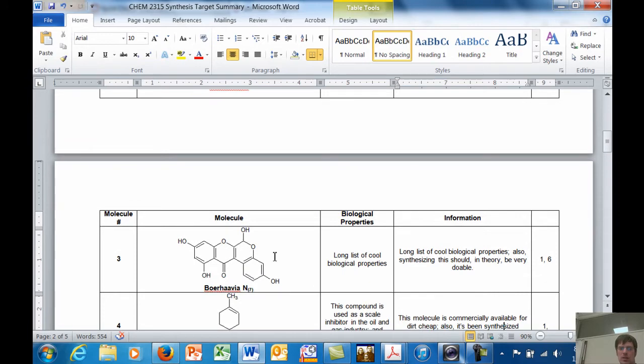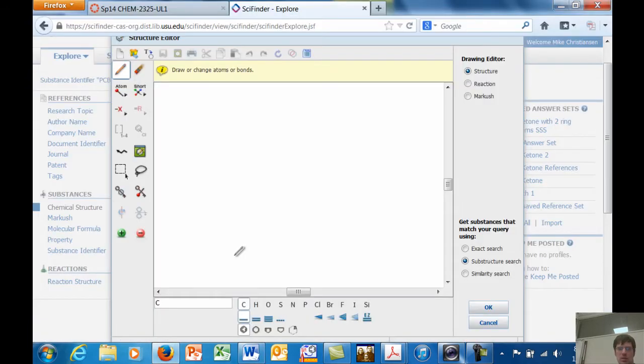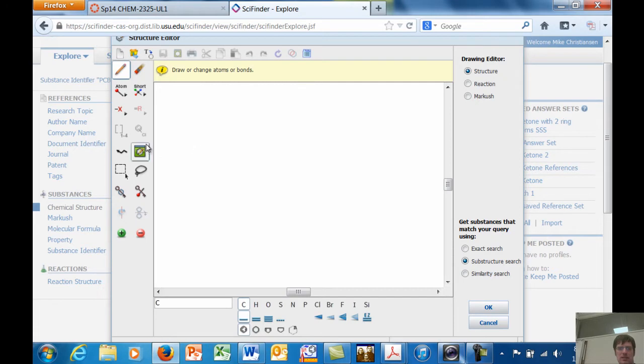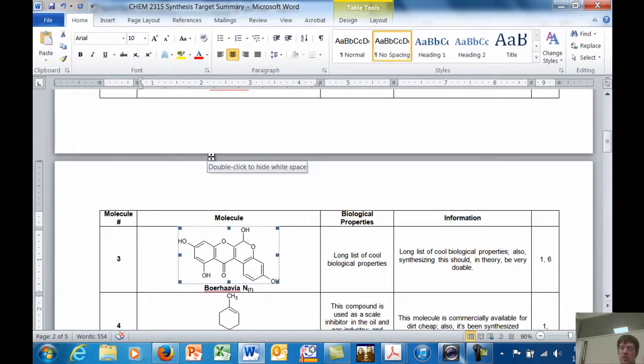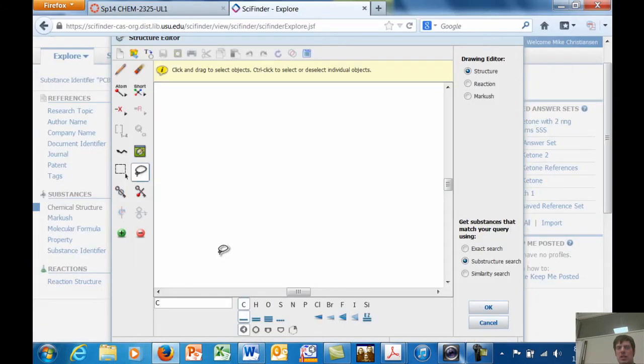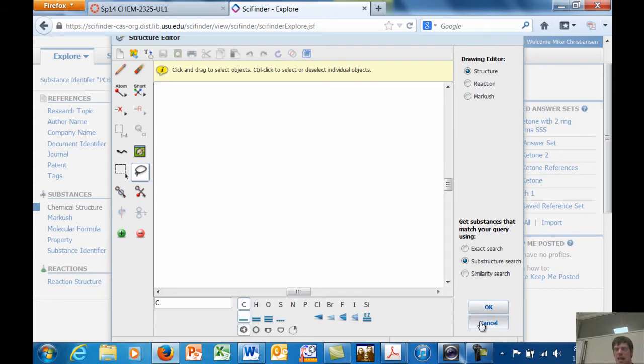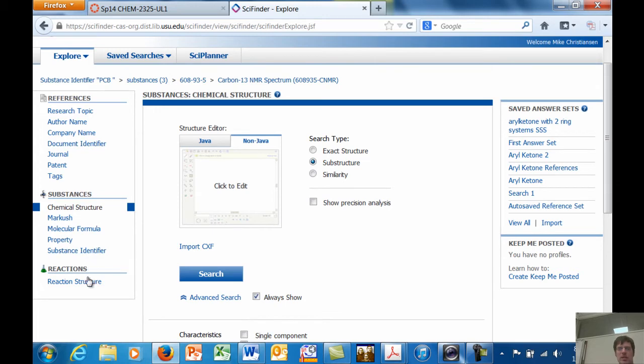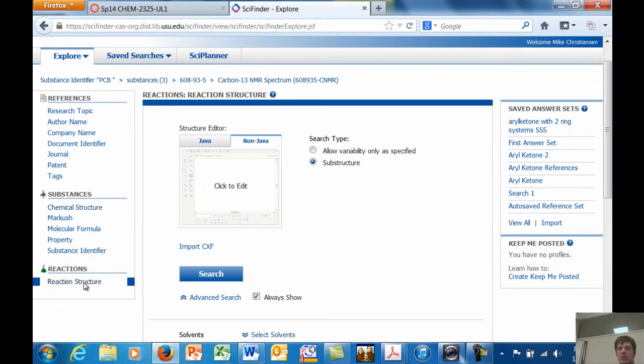But right now, I don't really want to draw this molecule. I wonder if I can just copy and paste it in there. Yeah, I don't think it pastes from Microsoft Word. But anyway, you can draw this molecule, and you can find it that way, rather than typing in a name. You can type in molecular formula. But this is the part that I think is really cool. You can type in reaction.